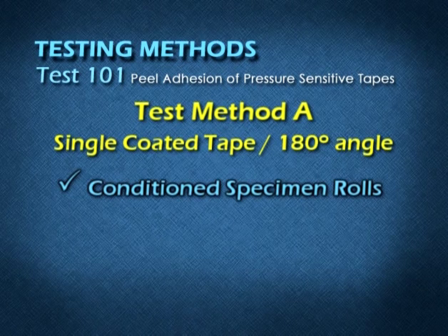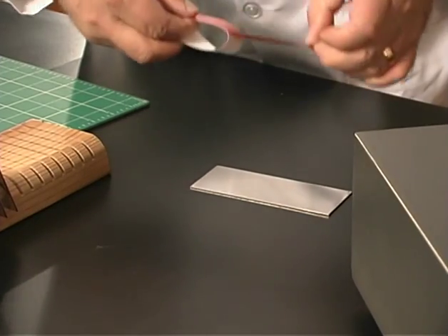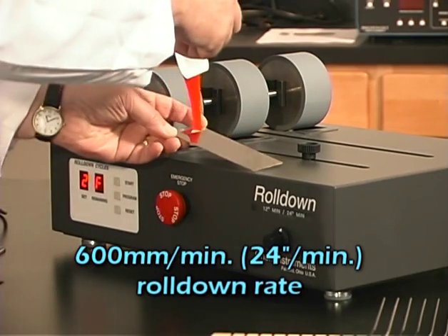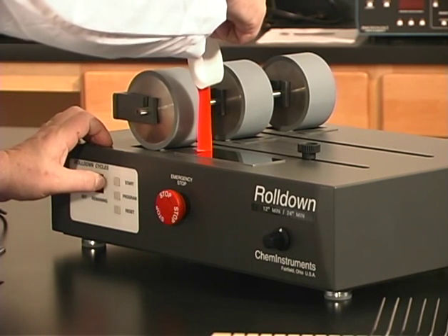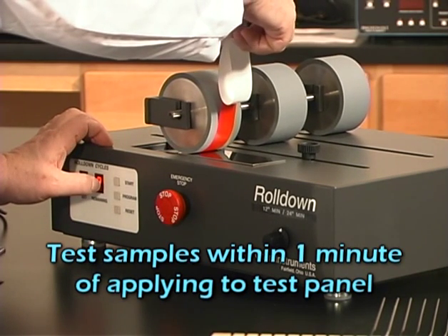After you have conditioned your specimen rolls, cleaned your test panel surface, and pulled your first sample, apply it to the test panel using a 2 kg hand roller or mechanical roller at a rate of 600 mm per minute. Because a longer dwell time can increase adhesion, individually prepare each specimen and test within one minute.